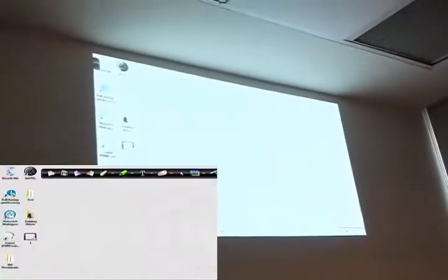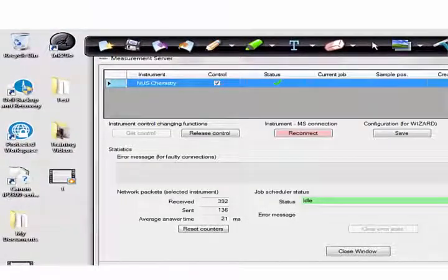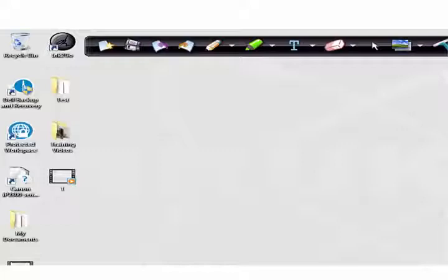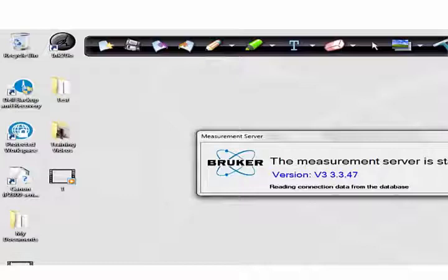When the icon is green and the X-ray indicator is yellow, you know you can start your measurement anytime. When it is green, the measurement server icon will be white — you can double-click on it and click on the status window. You can close it, but do not exit. If you press exit, you will disconnect the PC from the system and the button will turn white. So close, but don't exit — I'll re-establish the communication between them.